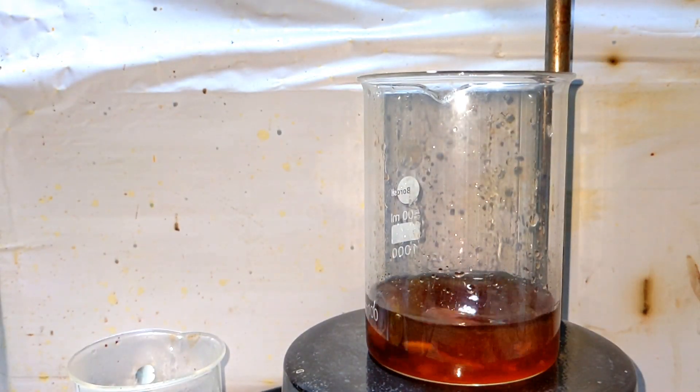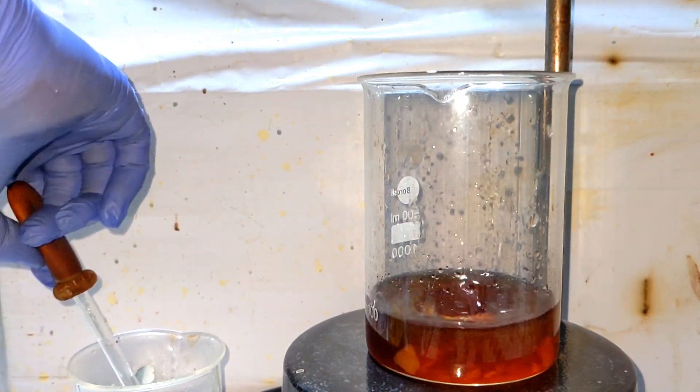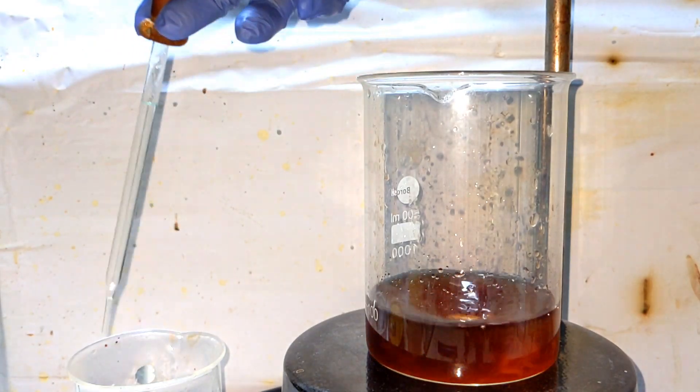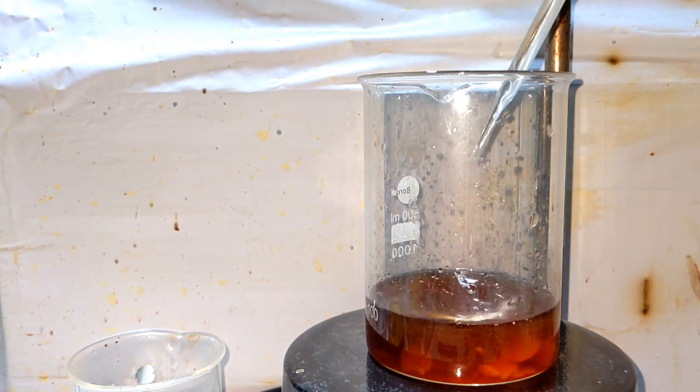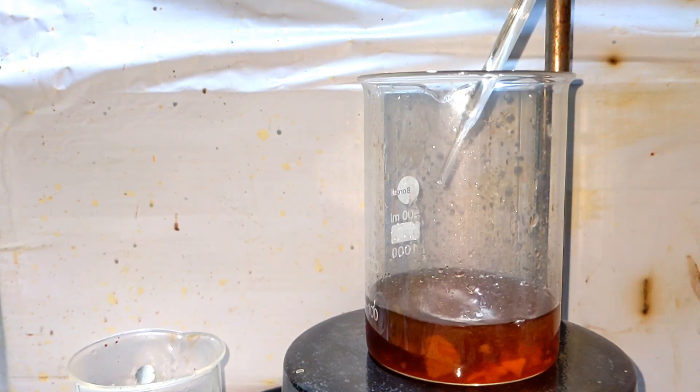Now 29 milliliters of the 37% hydrochloric acid was added to the beaker with a pipette with stirring. Care must be taken to add the acid in small amounts as a lot of frothing can take place in this reaction as the carbon dioxide gas is released.